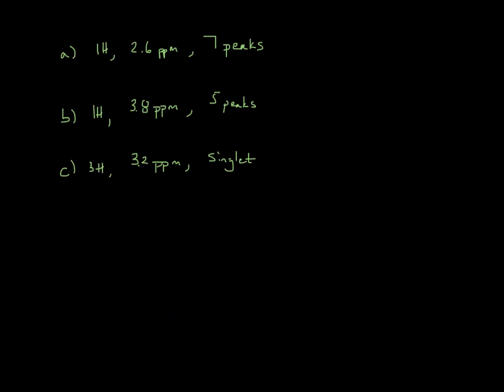These will be the first things we talk about in class. So remember, look at your multiplicity, look at your number of hydrogens from your integrals, and look at the chemical shift and try to put them together.